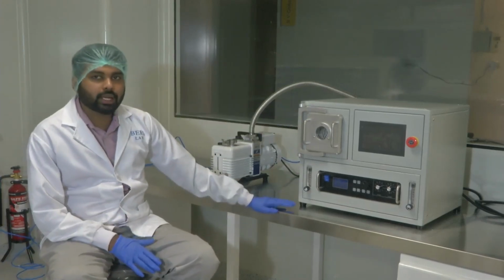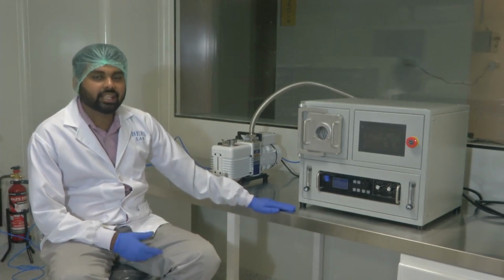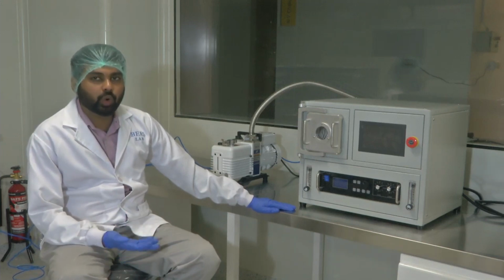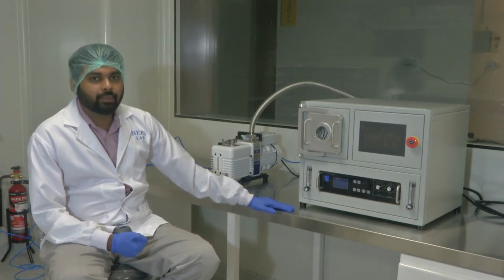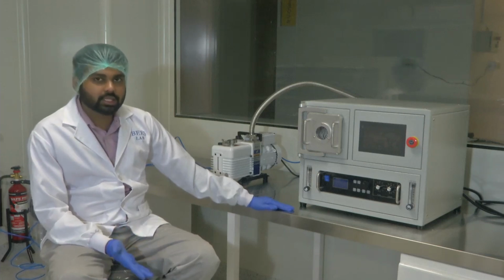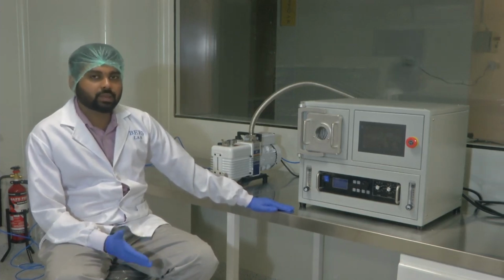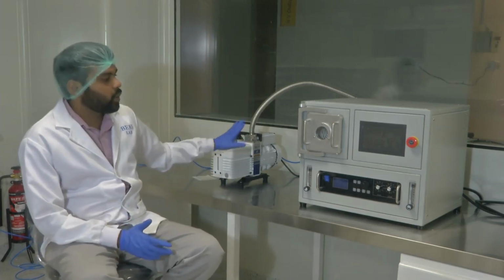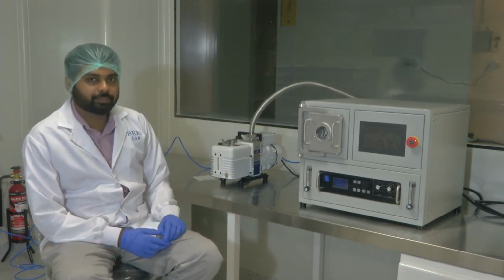Okay. Now what is this? I told you that a plasma cleaner or plasma bonder is used to clean the substrate, activate the substrate, and surface modify a substrate before coating and all. It's a standard material processing technology. It is also conventionally used in biomedical devices, especially in microfluidic devices, to bond micro channels made with PDMS onto a glass substrate. This I had already told you before. Before I get into how this system operates, and showing you a live demo, you need to first understand what is plasma.